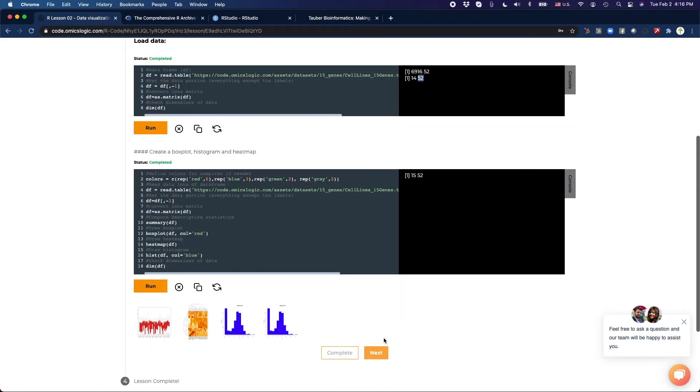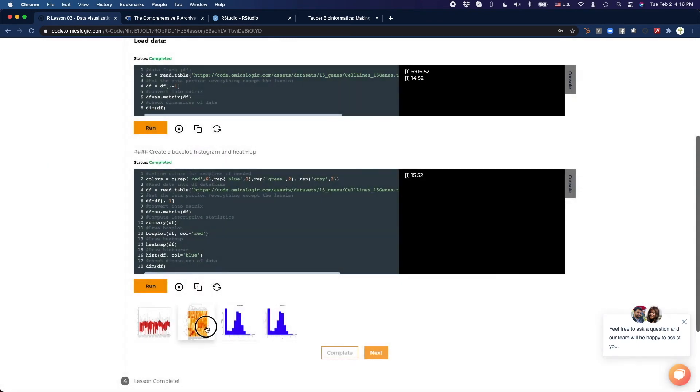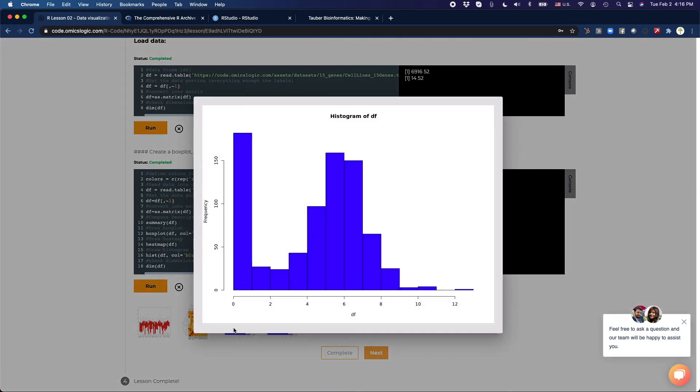Now we can take this data and visualize it. We can make a box plot, and we have a heat map, or a histogram.